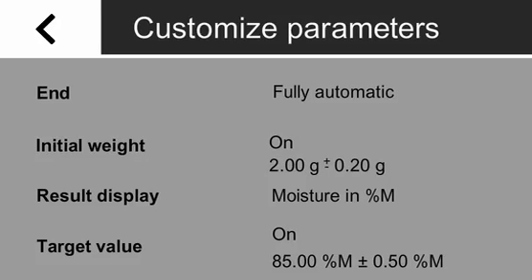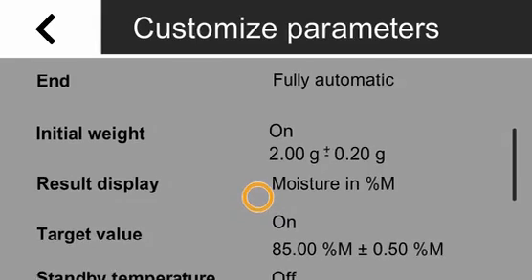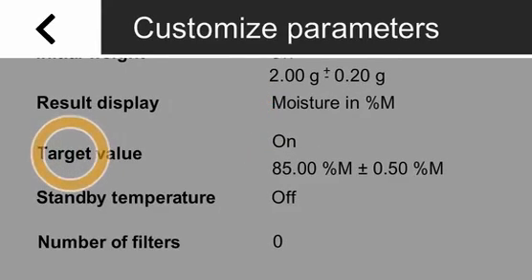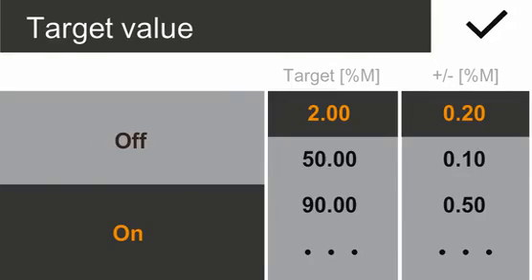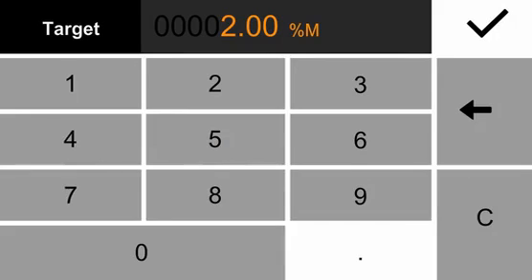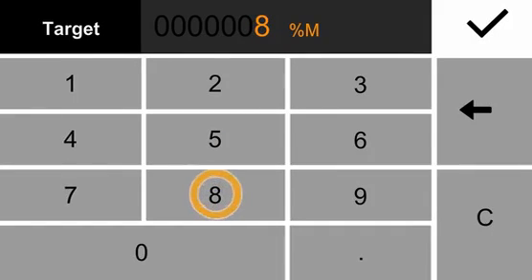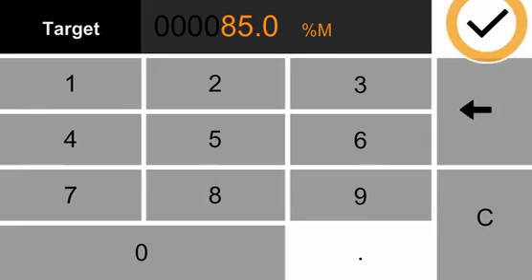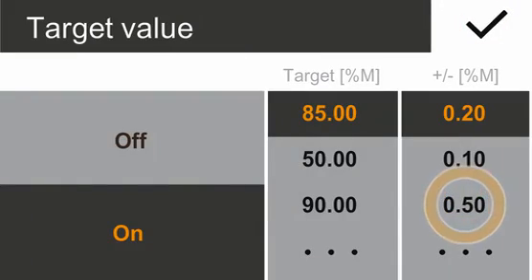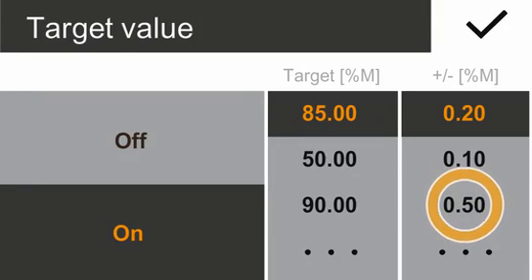Now, please select a target value. Please tap On and select the manual input. Enter 85 via the digital keypad and confirm your entry. Select the required tolerance of 0.5% and confirm again.